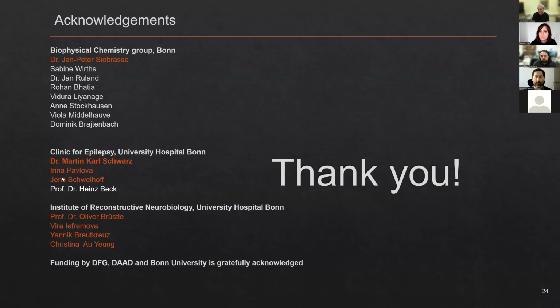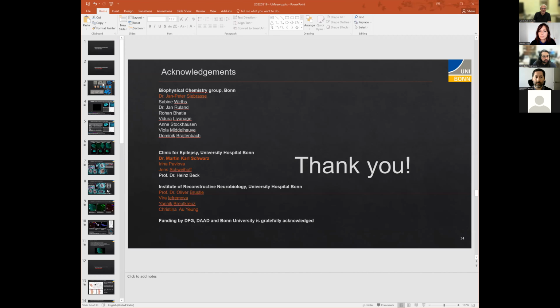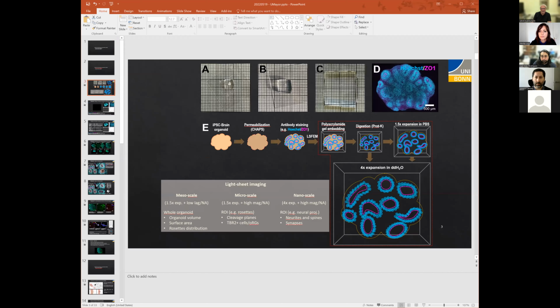But expansion is not always required. Now, I really want to stress this. It really depends on what you are interested in. And what is the advantage of expanding your sample? I think the advantage, Juan, go to your first slide, and that shows it immediately. Now, the sample in image A, you see the white point. This sample is scattering the light heavily, and that will really reduce all information that you will get out of your sample.